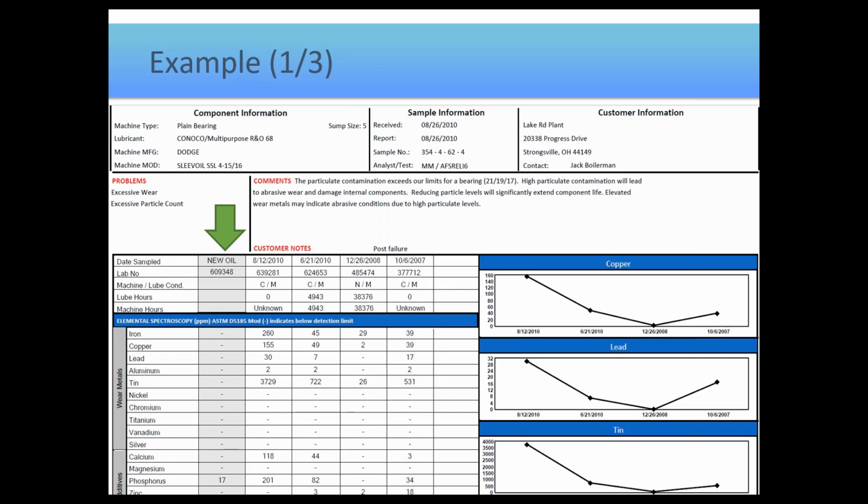This is not information that we get direct from refineries or oil blenders or anything like that. It comes from the end users who send in the other samples. And we typically recommend that it gets sent in about once a year. It does not have to be any more often than that. It's not with every batch of samples, but that is how it gets populated. So sometimes you may find that these things become out of date, and it's because, well, we haven't received a sample of that particular product in its virgin state in a while. So just letting you know, one, what that column is, and two, how the information gets there.